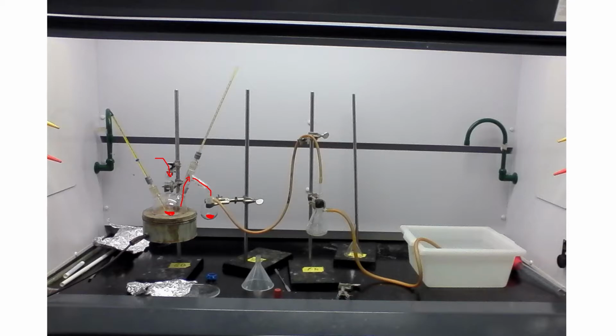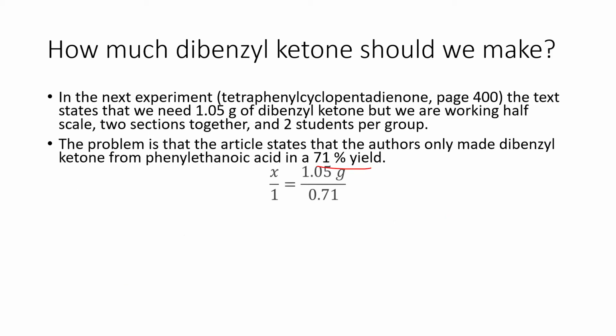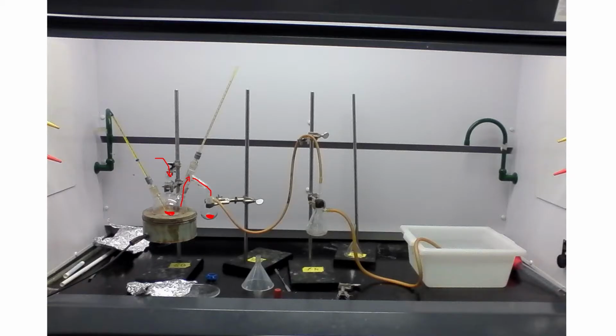Something that's very important for this reaction is we need to keep track of the gases, because the gases will let us know how the reaction is going and when it's completed. Remember that some of the byproducts for this reaction are hydrogen gas and carbon dioxide. And we're going to keep track of both. So what ends up happening is, as we have this reaction, the hydrogen gas and carbon dioxide will also continue up, go into this flask, but they will all continue down through this tubing.